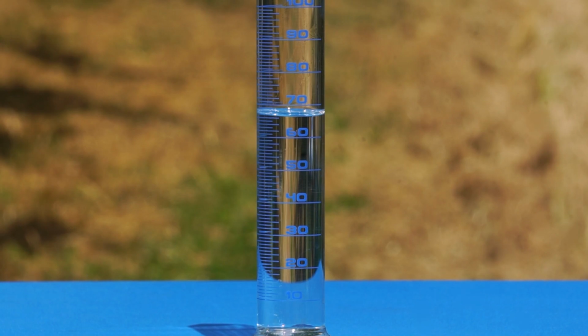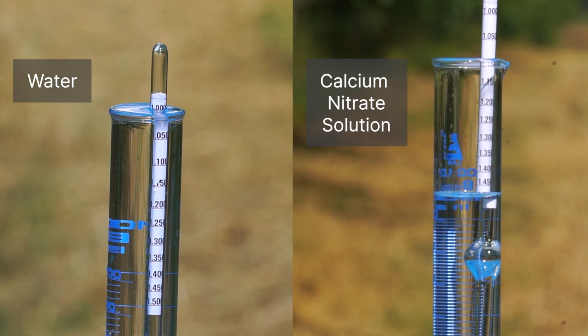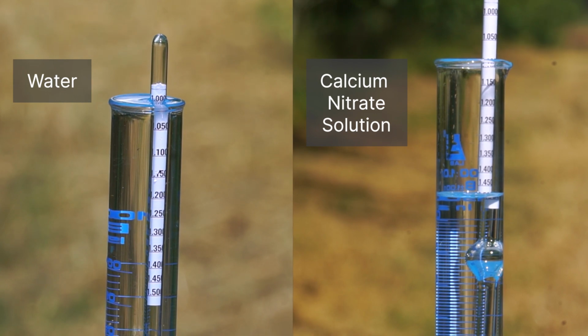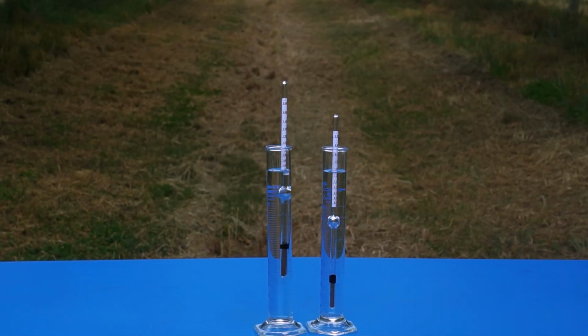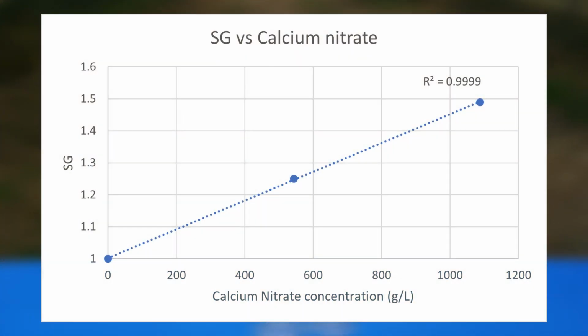Using our hydrometer, we can tell that adding the fertiliser has increased the SG of this liquid from 1 for water to 1.49. So we can see that dissolving fertiliser in solution will raise the solution's SG or density. The SG of the solution is directly related to the amount of fertiliser dissolved in it. To demonstrate this, compare the SG when the same calcium nitrate solution is shandied 50-50 with water. In fact, you can even use SG to determine the actual concentration of liquid fertilizers if you have enough information. In this case, with the data we've just collected, we can determine the concentration of any calcium nitrate solution just based on the measured SG.